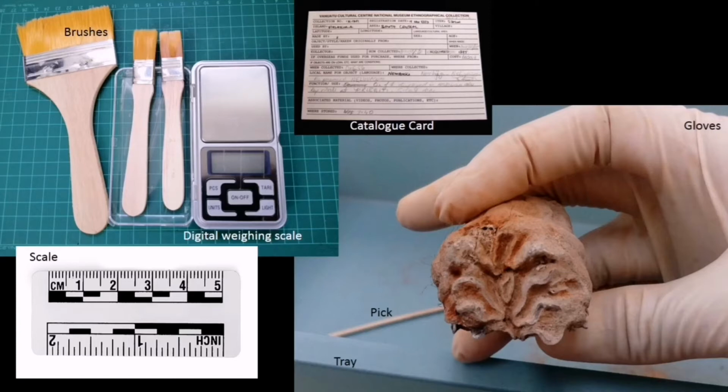We need a wooden pick to remove some excess debris on the bone samples, and of course we need to handle the samples using gloves. We do not want to contaminate our samples, nor do we want the samples to contaminate us. Well, working in the lab, we need to be systematic. So prepare some trays to place all the samples accordingly.